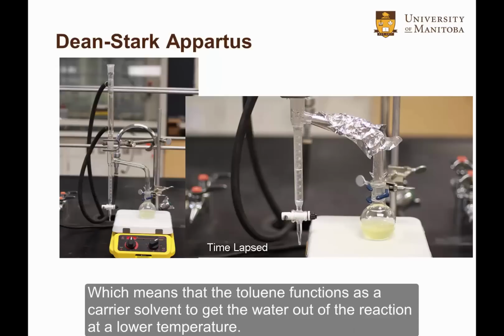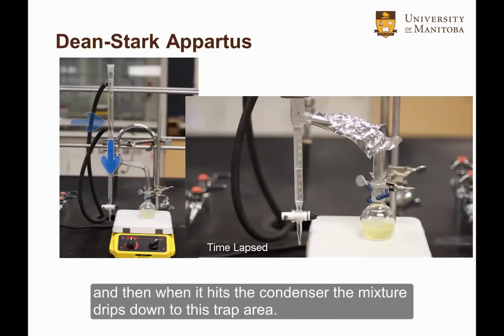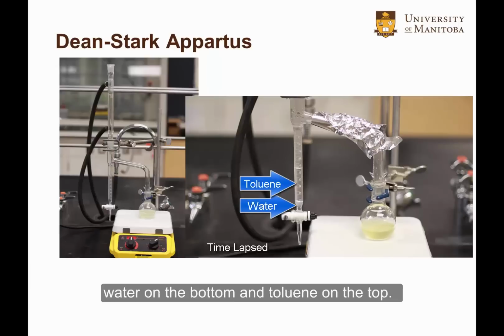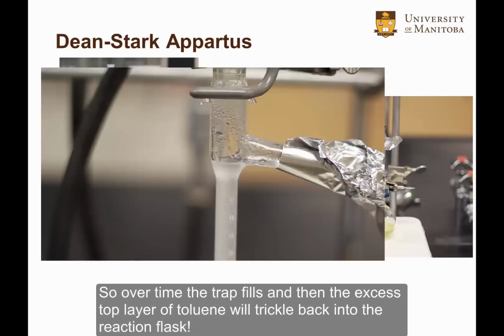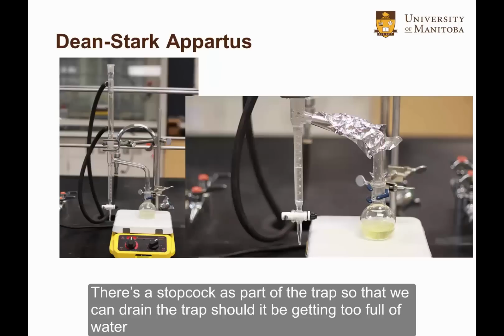Which means that the toluene functions as a carrier solvent to get the water out of the reaction at a lower temperature. So you can imagine that the mixture of toluene and water ascend this inclined sidearm, and then when it hits the condenser, the mixture drips down to this trap area. One of the neat things about using toluene is that it's immiscible with water, so in liquid form we'll see two layers, water on the bottom and toluene on the top. So over time the trap fills, and then the excess top layer of toluene will trickle back into the reaction flask. There's a stopcock as part of the trap so that we can drain the trap should it be getting too full of water.